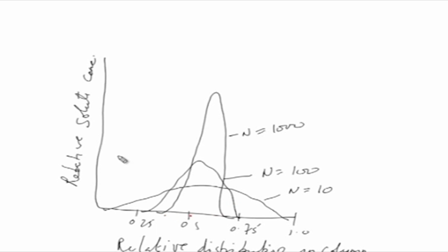It is like its distribution in the column, where it is distributed in a small area rather than in a bigger area where the theoretical plates were fewer. If the theoretical plate is 1, then the sample just comes out in the void volume. But as the number of theoretical plates increases, the analyte also distributes itself into the stationary phase and mobile phase in very small adjacent zones, and it spends more time there, and therefore you get a peak which is present in a smaller area as compared to a larger area.